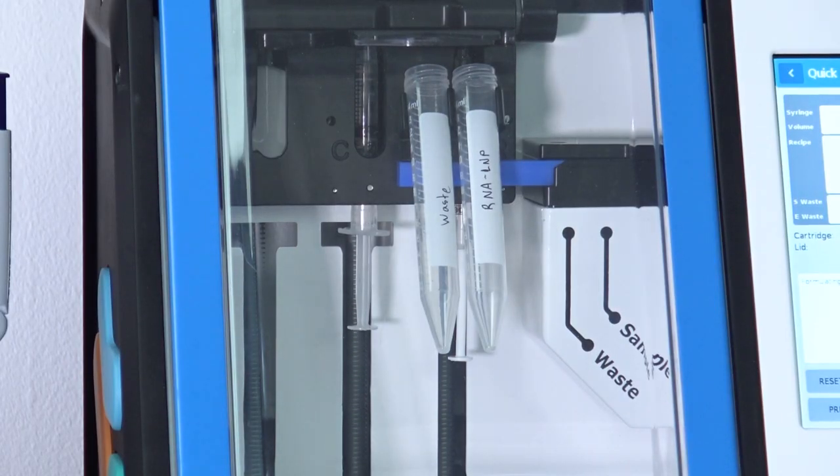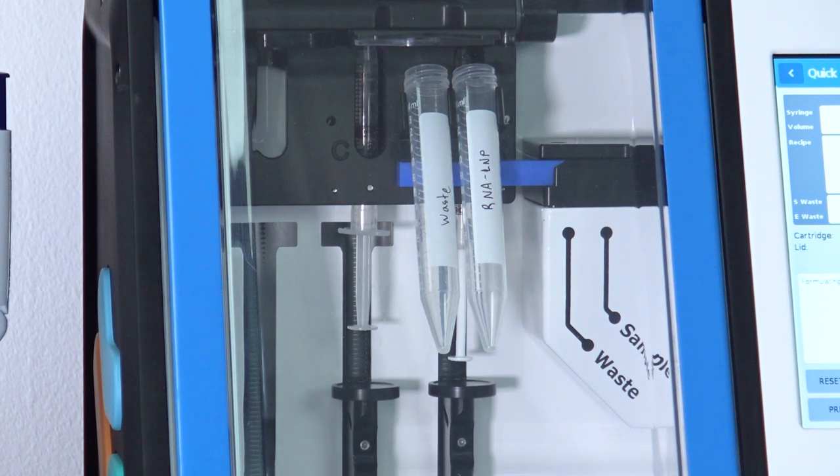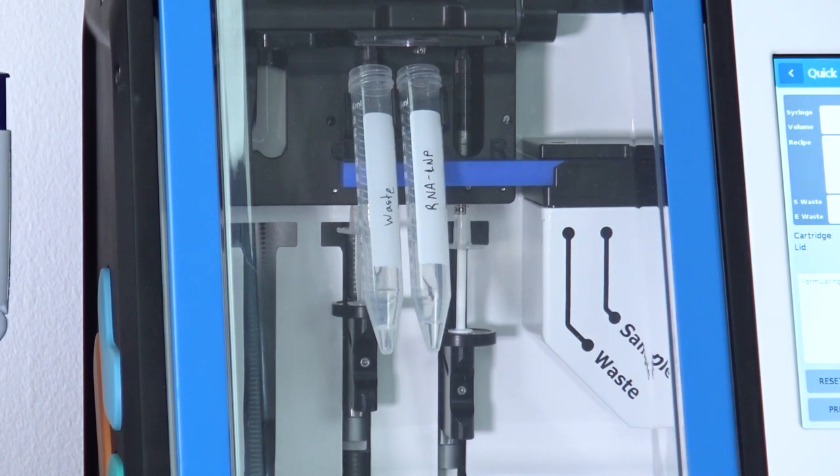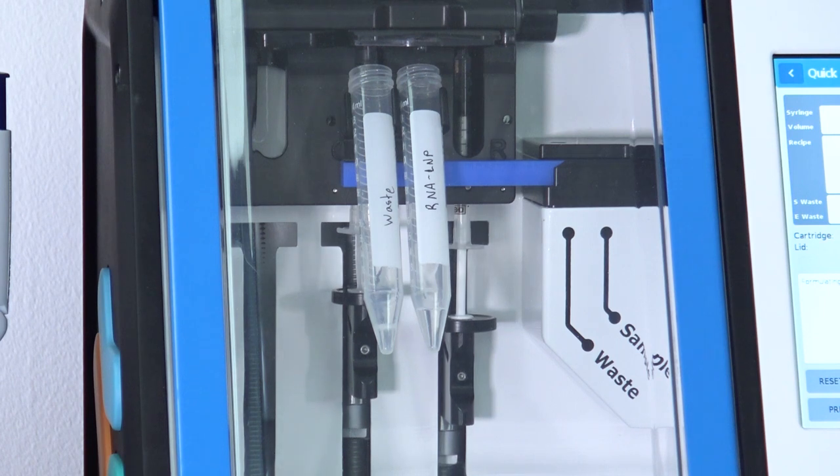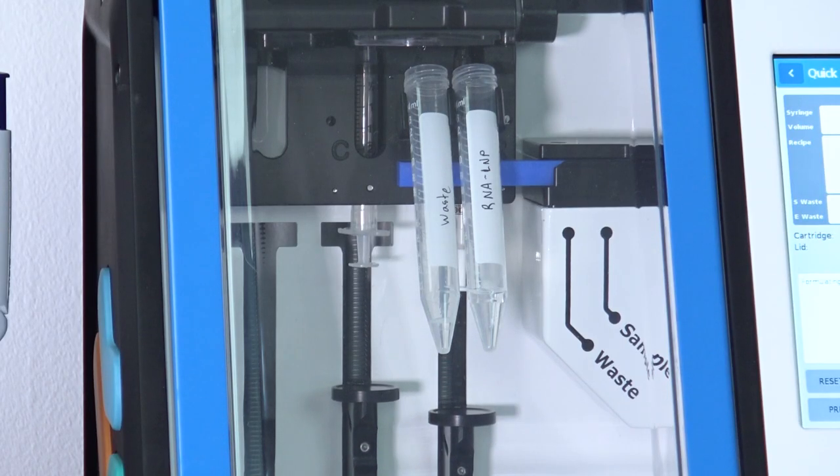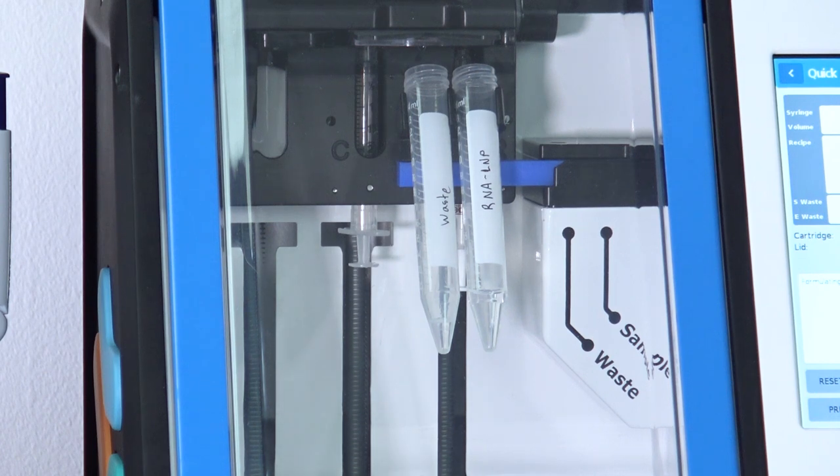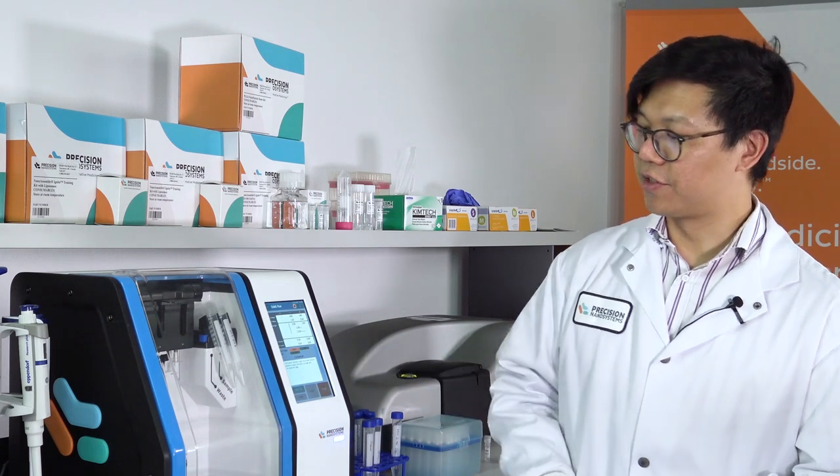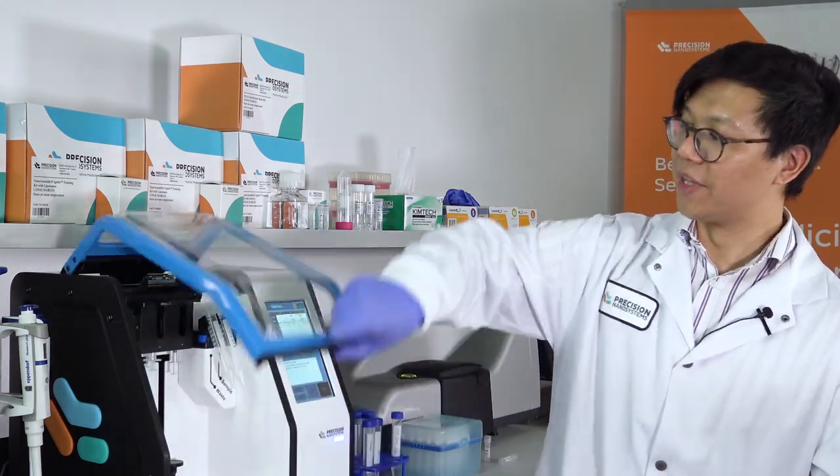So here the paddles will approach the syringes and detect the bottom of the syringes automatically. The first part of the formulation is collected in waste. The rest of the formulation is collected into your sample container. The progress bar here indicates that it's done. All of your parts then will return to the home position, including your sample switch arm. And just like that, your formulation is complete. So once the formulation is complete, it'll say completed on the screen. And then you'll be safe to open the lid and retrieve your sample.